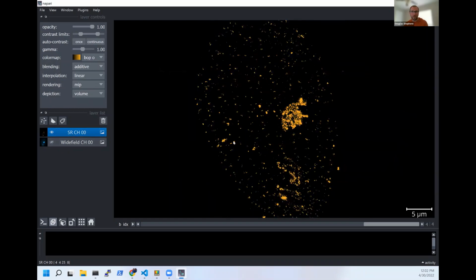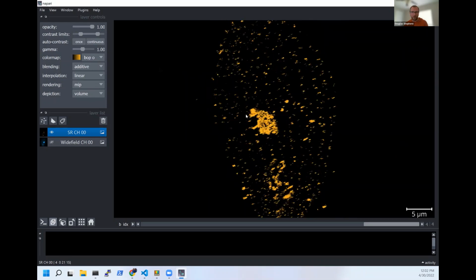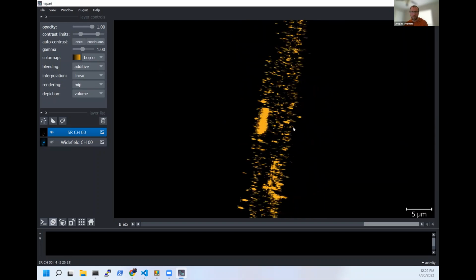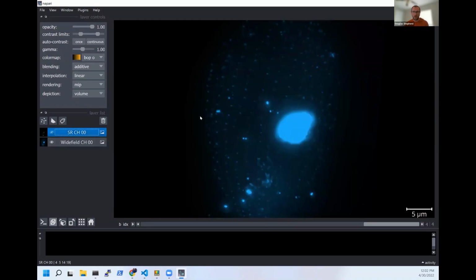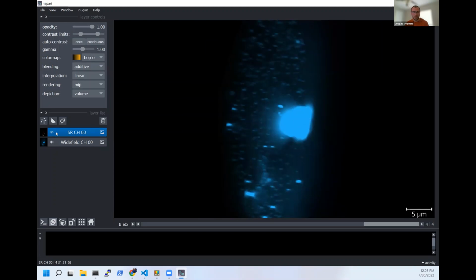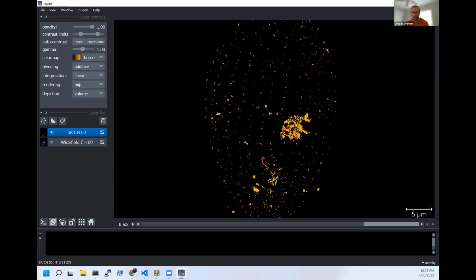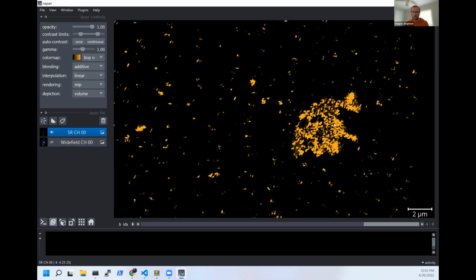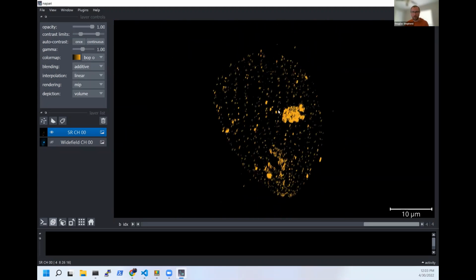we just look at the SIM data, you can see we've pretty much eliminated almost all of the background blur that we had by using the information in the SIM bands to get rid of the information near the DC peak. So again, just to click this back on, lots of background haze, really large amount of background light in this area with a lot of labeling. Whereas now when I click here, actually we even start to try and recover some sort of super resolution, or even maybe just normal diffraction limited resolution, but limiting that out of background light there.